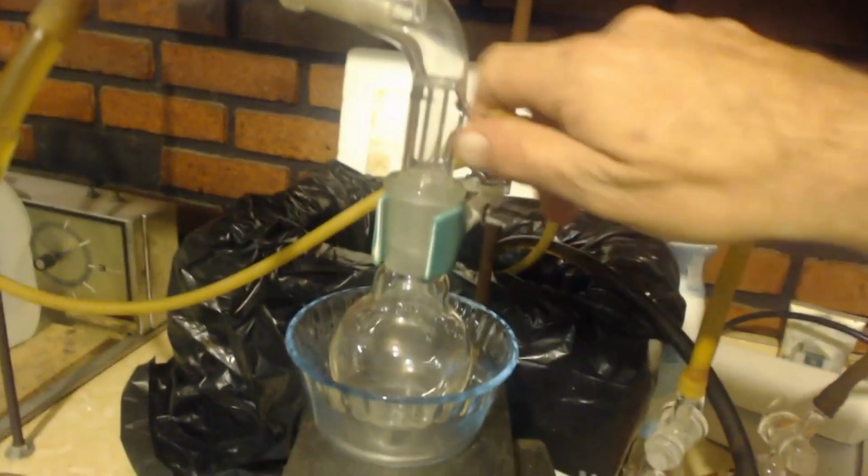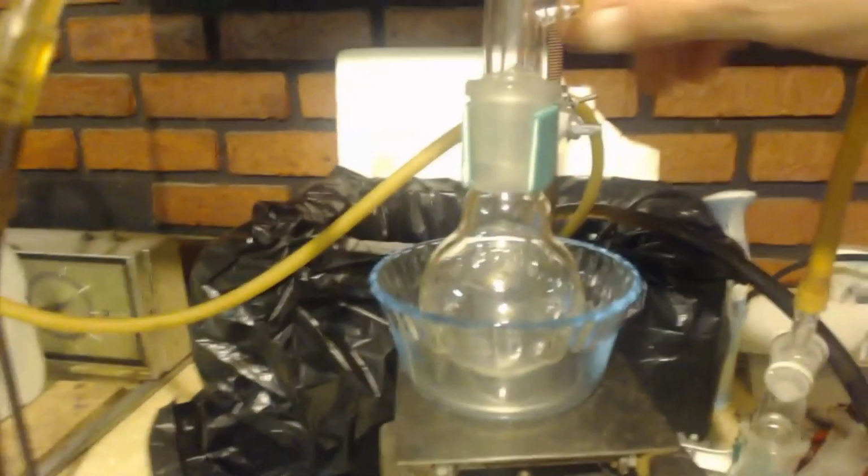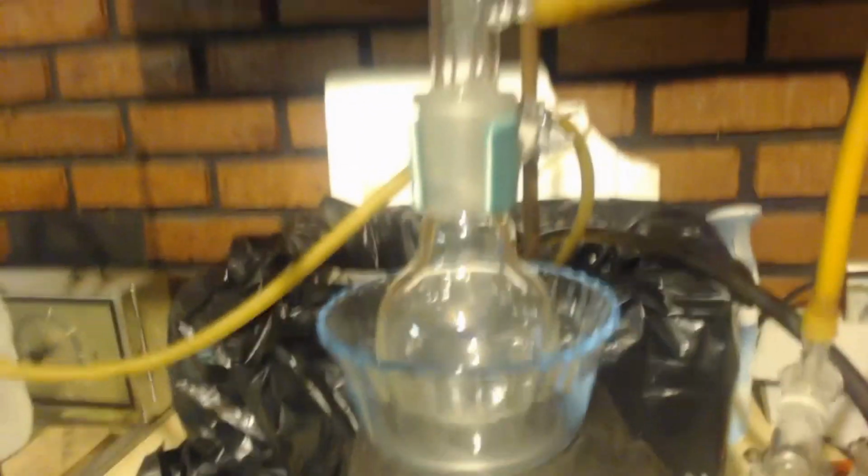I figured I'd use them instead of putting, usually I put a piece of Kleenex in this outport in the receiving flask. I don't push it in there so it's plugged, I push it in there so it's a filter. You know what I mean? That way some of the gases get kind of stuck in there.